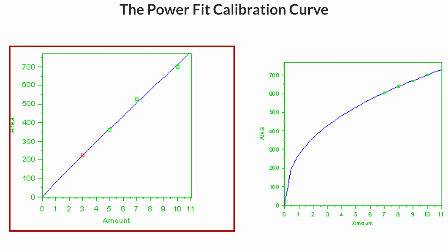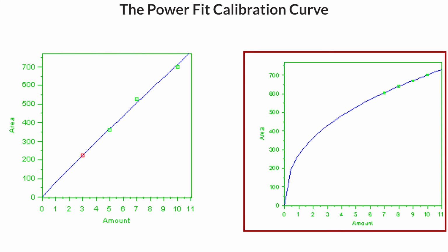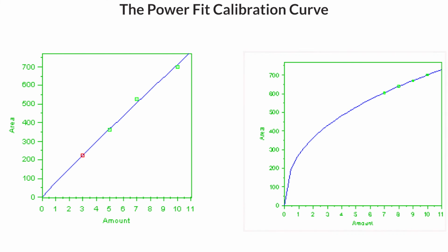The curve on the left has its calibration points evenly distributed, and the fitted curve is well behaved. In the curve on the right, the points are confined to the highest levels, and generate a statistically correct but physically inappropriate calibration curve. If used for quantification, such a curve will have significant error at low levels. The apparent extrapolation to the origin is an artifact of plotting the curve that vanishes as the curve is magnified.